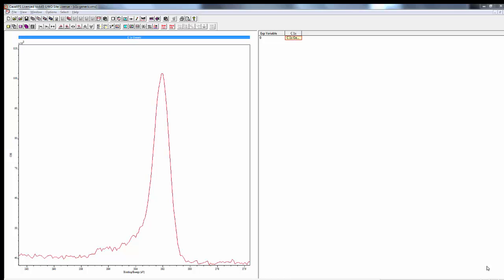The first step in XPS data processing for many samples is to fit the carbon 1s peak, particularly if we're going to use adventitious carbon as a charge correction. This procedure is a good starting point for fitting adventitious carbon and also for fitting general organics on a surface.